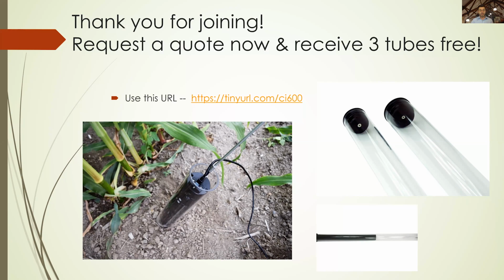So the next question is, how long can a tube last in the outside environment, especially under freezing conditions? That's a good question for acrylics. I know the CI-600, the scanner itself, has been used throughout an entire day of permafrost studies, so I know that will work. With the acrylic tube, I would have to ask some of the experts in the field regarding how long they last, but I do think it's years. My interest would be decades, but we definitely know it's over two different seasons, so you'll be absolutely fine.